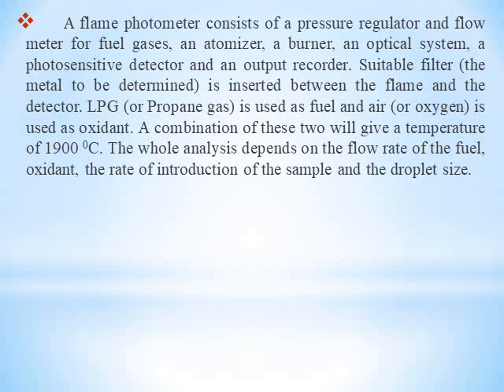At this temperature, salts get aspirated into the flame, vapors of the salts are formed, and they ionize in the gaseous state. Ionization is the separation of the metal from the halogen. Sodium gets separated, and chlorine gets separated.